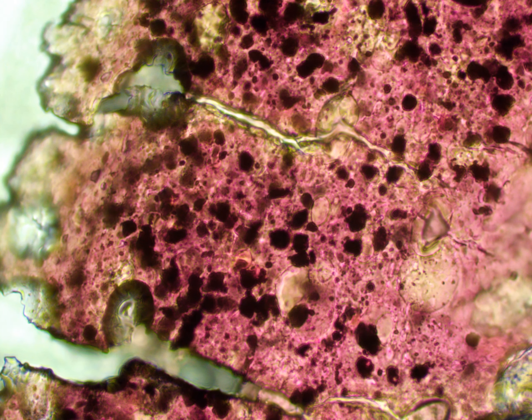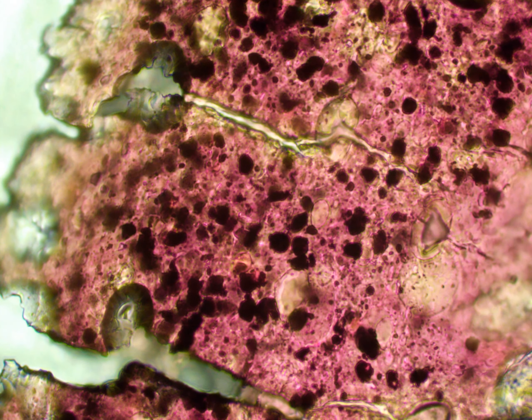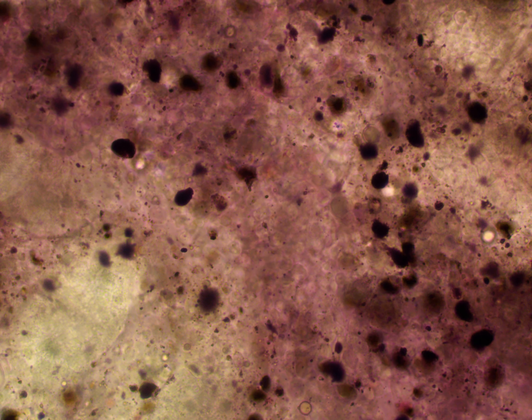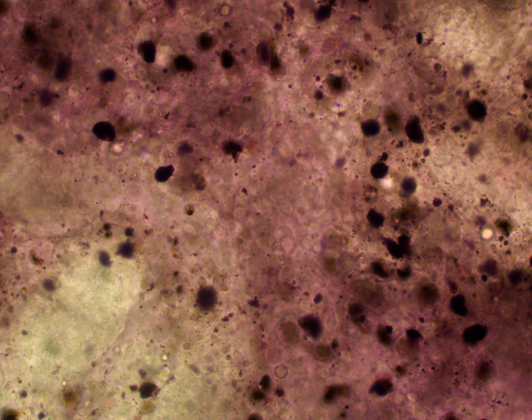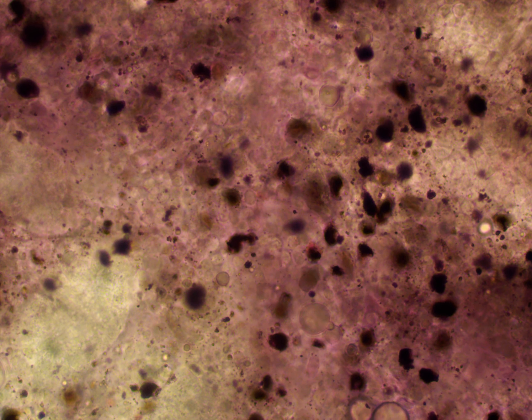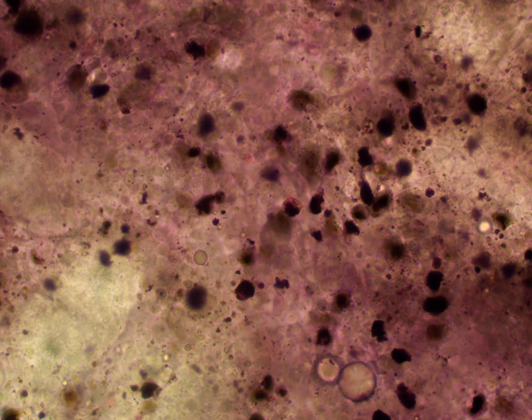Here is what those cells actually look like. This is with the 40x objective. You can see how they look — they are black, and you cannot see the nucleus. They're opaque. Human blood cells are usually transparent, but this is also a very thick sample. And you can see this going through here; this is not sped up at all. Even though the fish was clinically dead, its blood is still living, which is something people sometimes forget — that if something is clinically dead, all of its cells do not die. They are still living for sometimes hours after whatever that organism was is clinically dead, with eukaryotic animals.